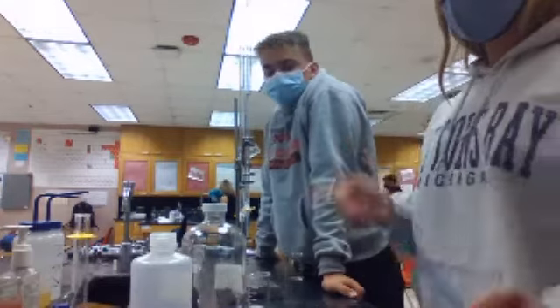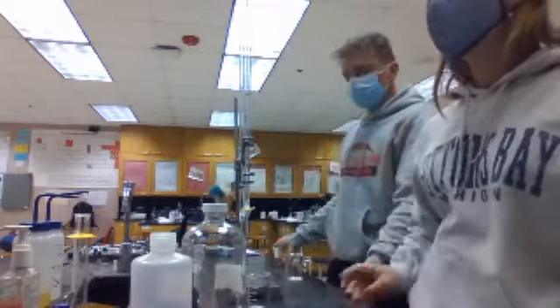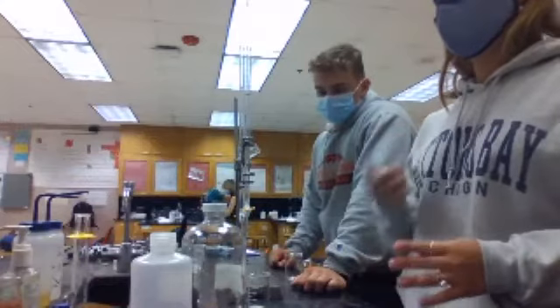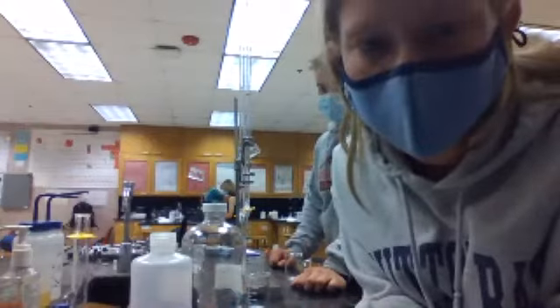Okay, so whenever we reach 7, that's when, yeah. Whenever you see the color change, that's whenever you mark here. Yeah, but you keep adding on the graph, and we keep taking the pH too. Yep. Okay. Did you guys hear that? Can you just repeat it? It was kind of blanking out a little.